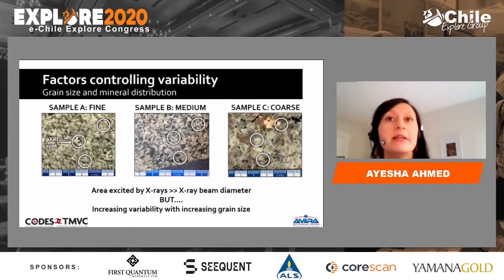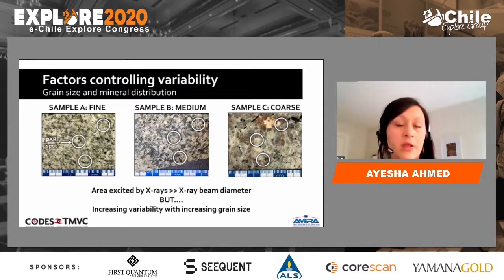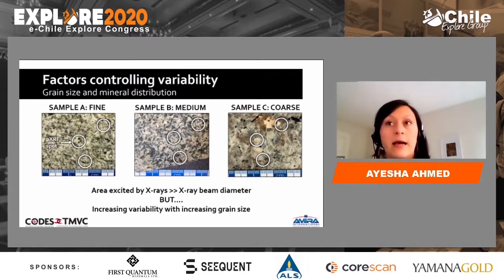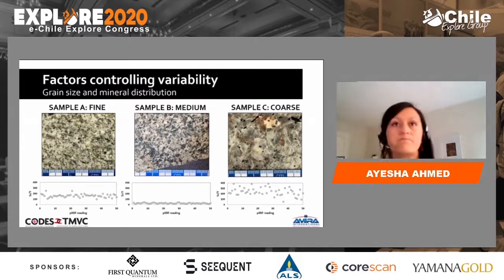And as you can see here, if we collect 3 different spots on the same sample, we're likely to get 3 different geochemical compositions. So the problem only gets worse the coarser the grain size. So the question follows, is the variability between multiple spots on a given sample acceptable to provide us with useful fertility information?